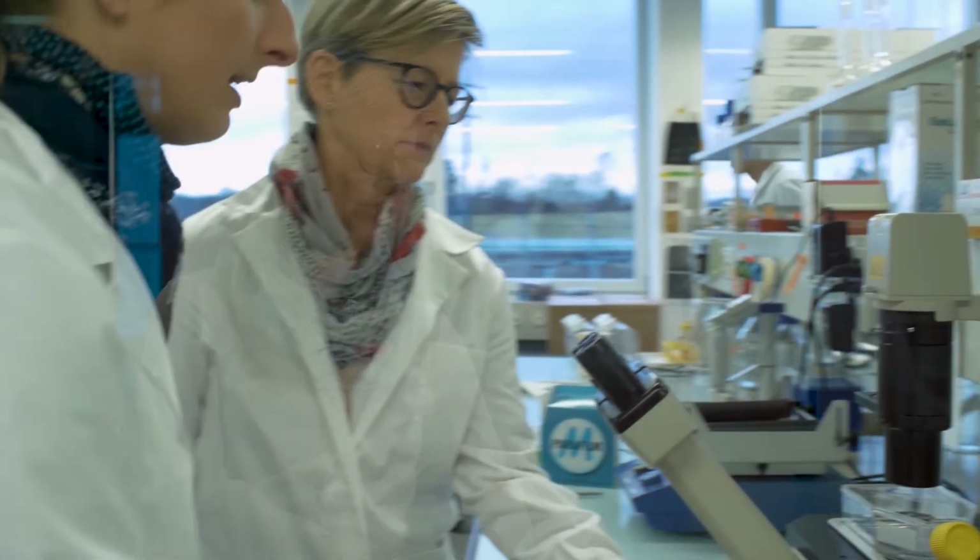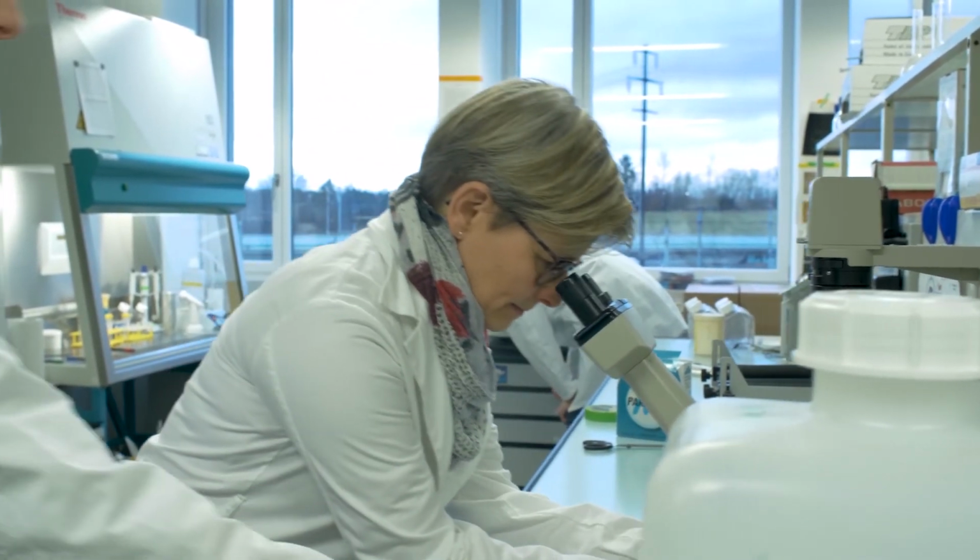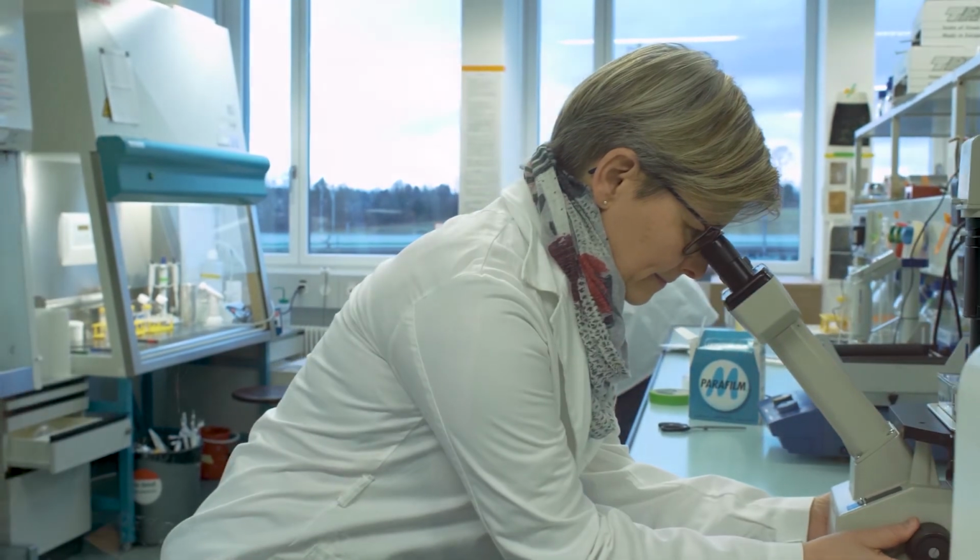So is this the end of the journey? Well, it's not, and we are quite happy to continue on this journey. As the gill cell line assay is now standardized, we got approached by people from outside of the institute whether we could test their samples with our methods.